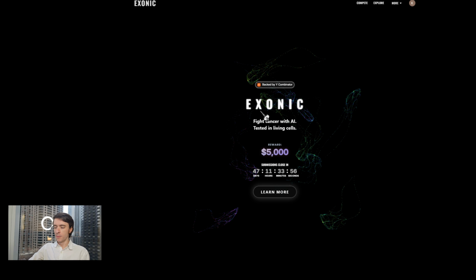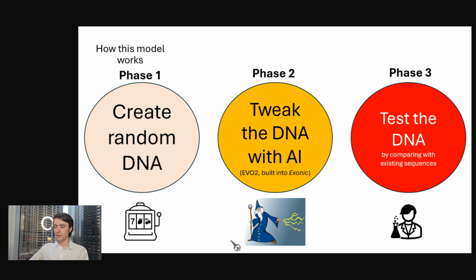I made this nice little explainer, a little PowerPoint screenshot here for you today to explain what I'm going to do. So here's the title. We've got how this model works. Phase one, first thing we're going to do is create random DNA. This is essentially DNA with very little meaning attached to it, just something that we sort of created on our own. Then we move into phase two, which is tweaking the DNA with AI, specifically the Evo2 model, which is conveniently built into Exonic's platform. And then we finish up with phase three, which is going to be testing the DNA according to several metrics.